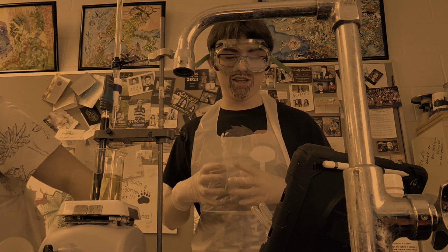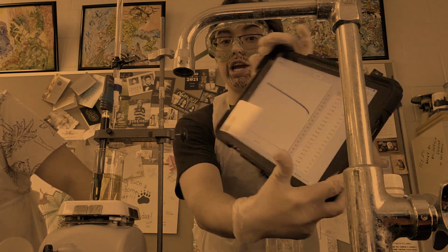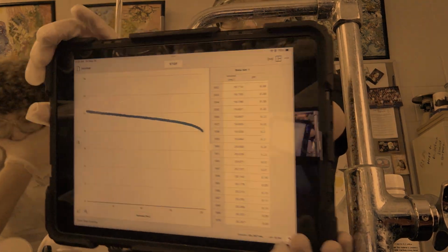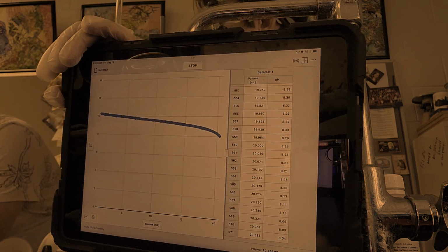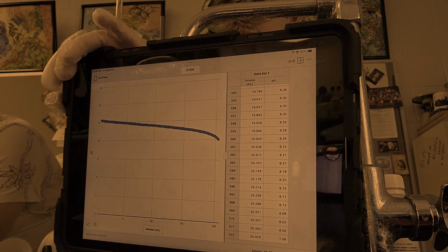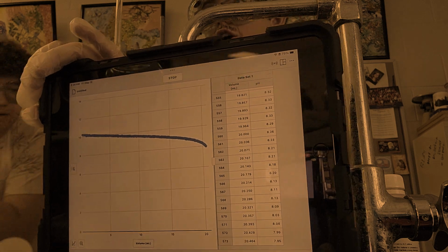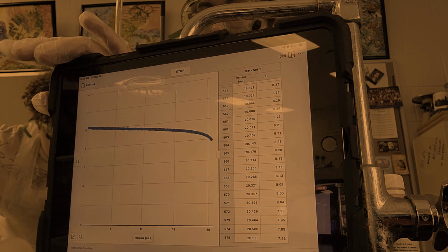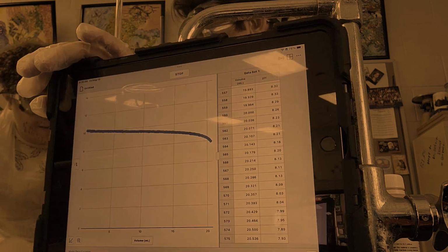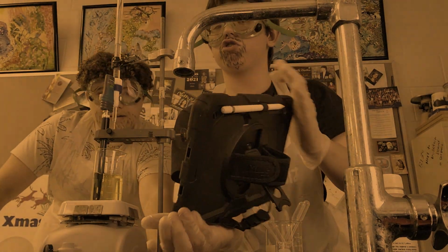And we say that methamphetamine is bad, but guess what? Take a look at this. Look at this graph. If you take a look, it's actually starting to go in the downward curve. That means, guess what we're nearing? Our equivalence point. And now, that means that we're getting real close to this point. Guess what? You should be keeping a lookout for this change in color.